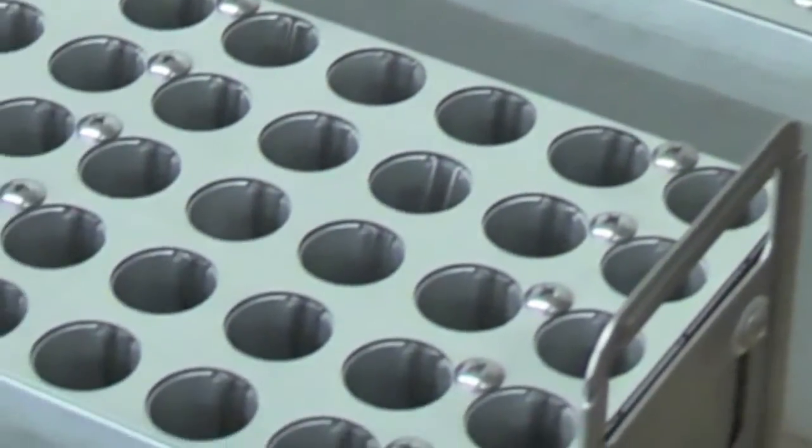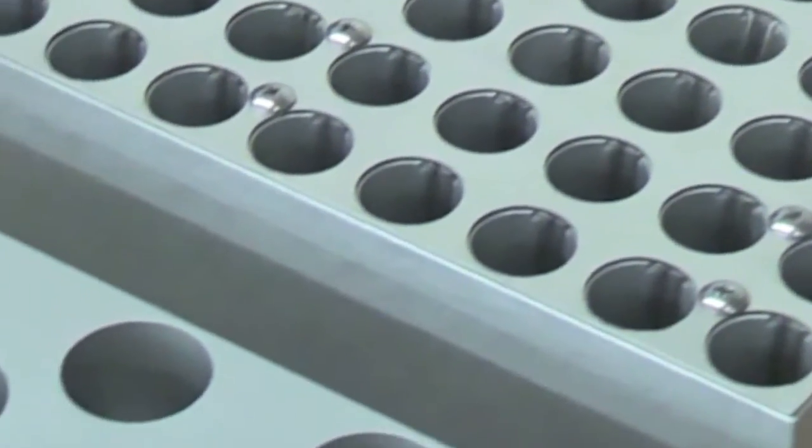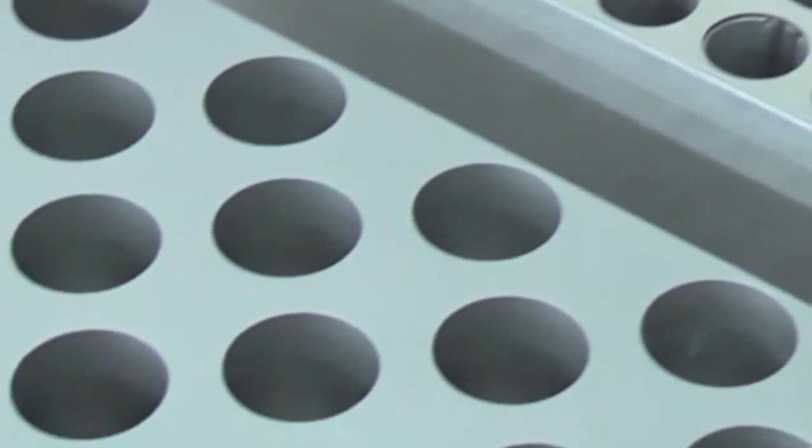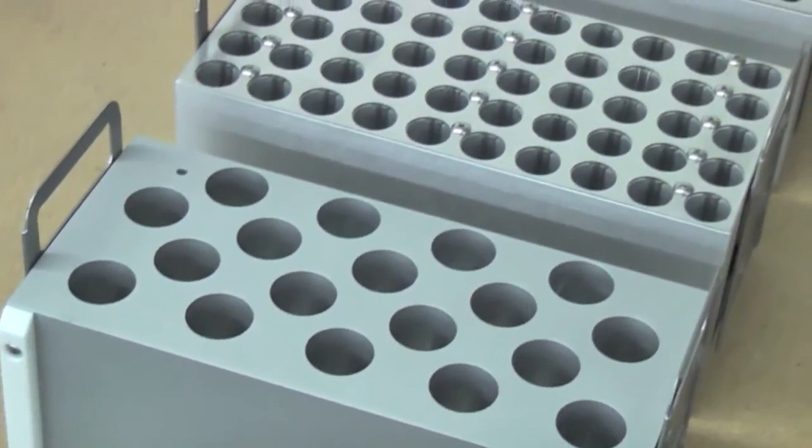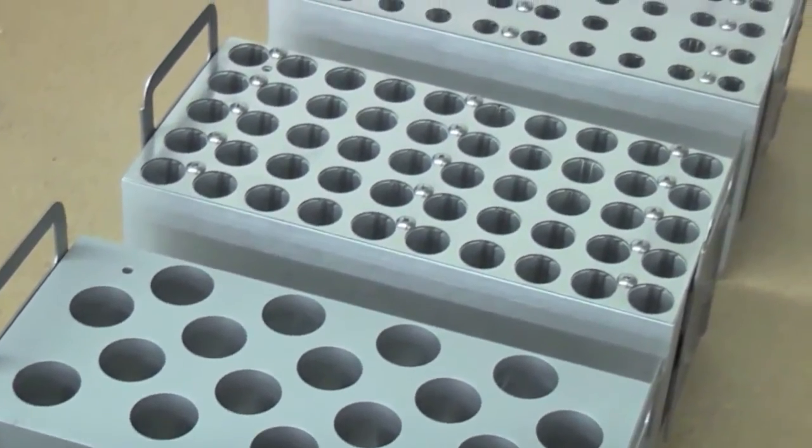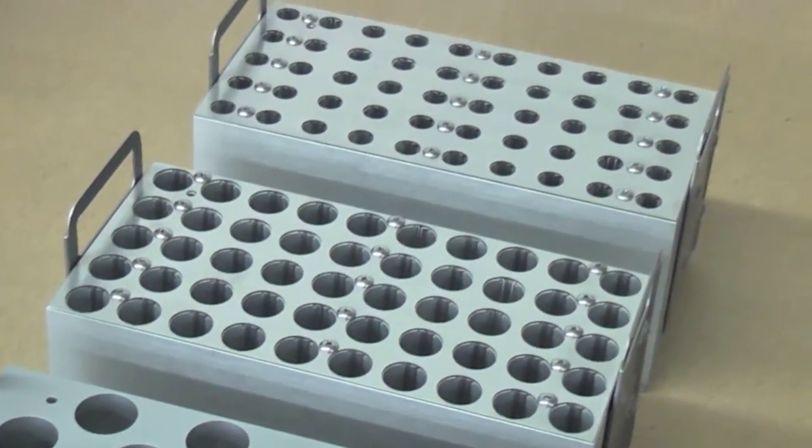Standard sample blocks for 1.5 mil microcentrifuge tubes, up to 40 and 60 mil ASE vials are available. Custom blocks can be ordered for your specific glassware.